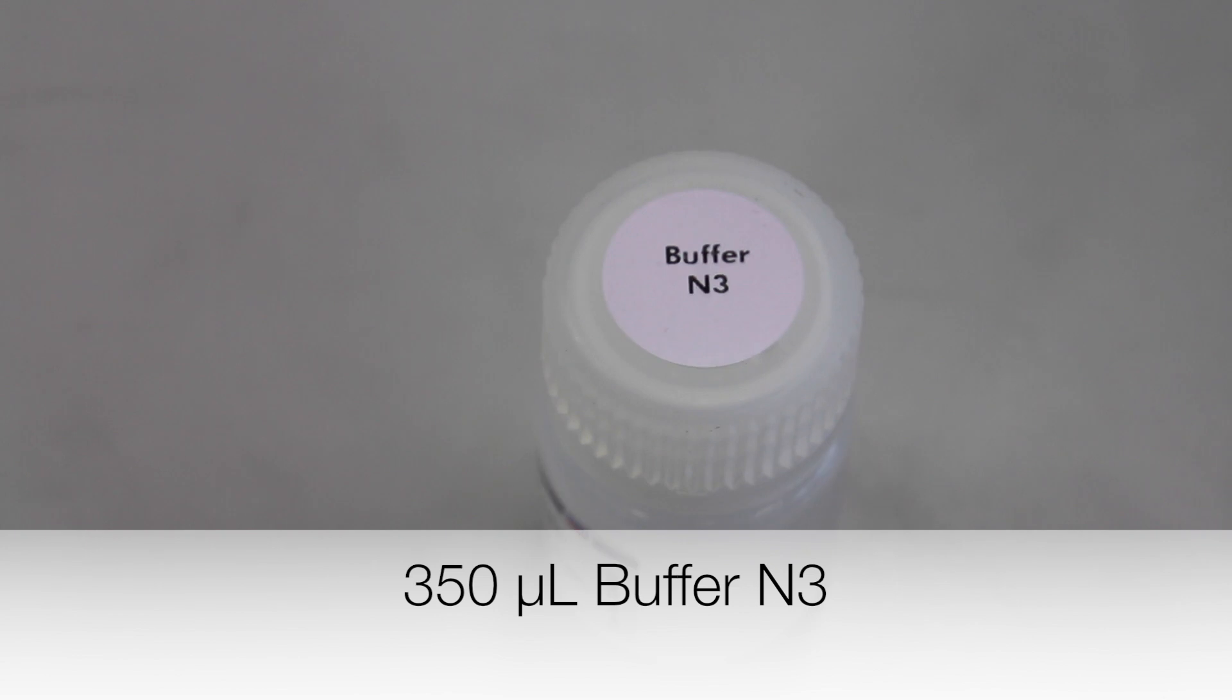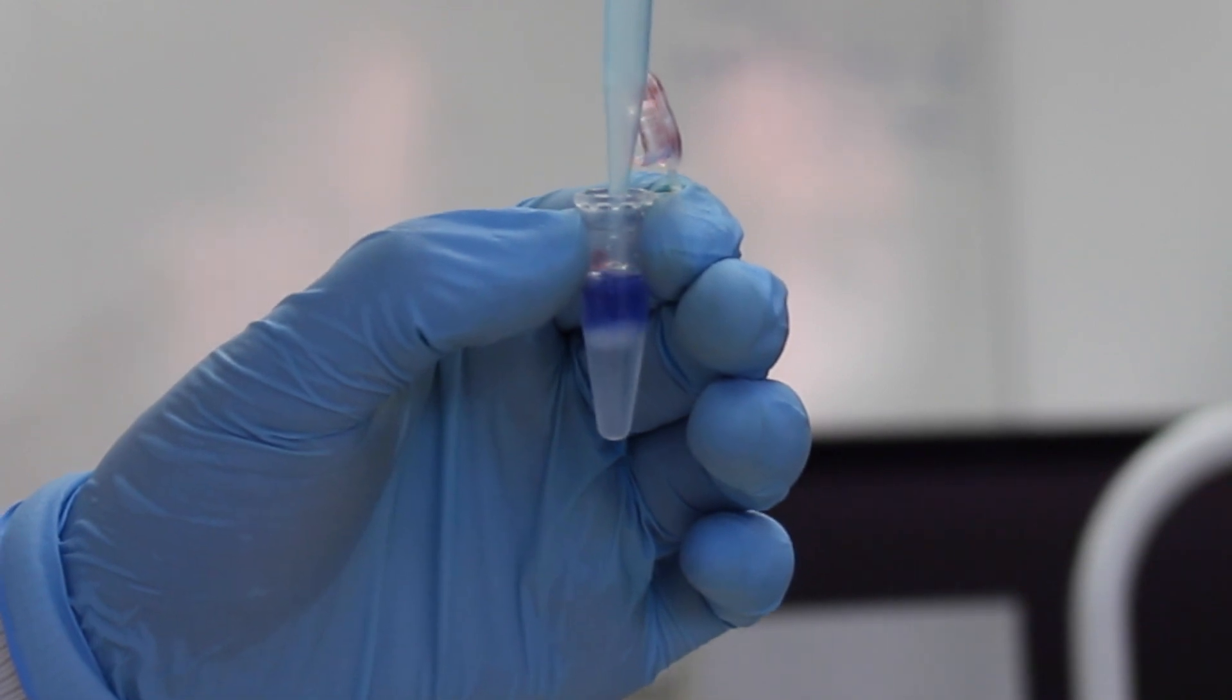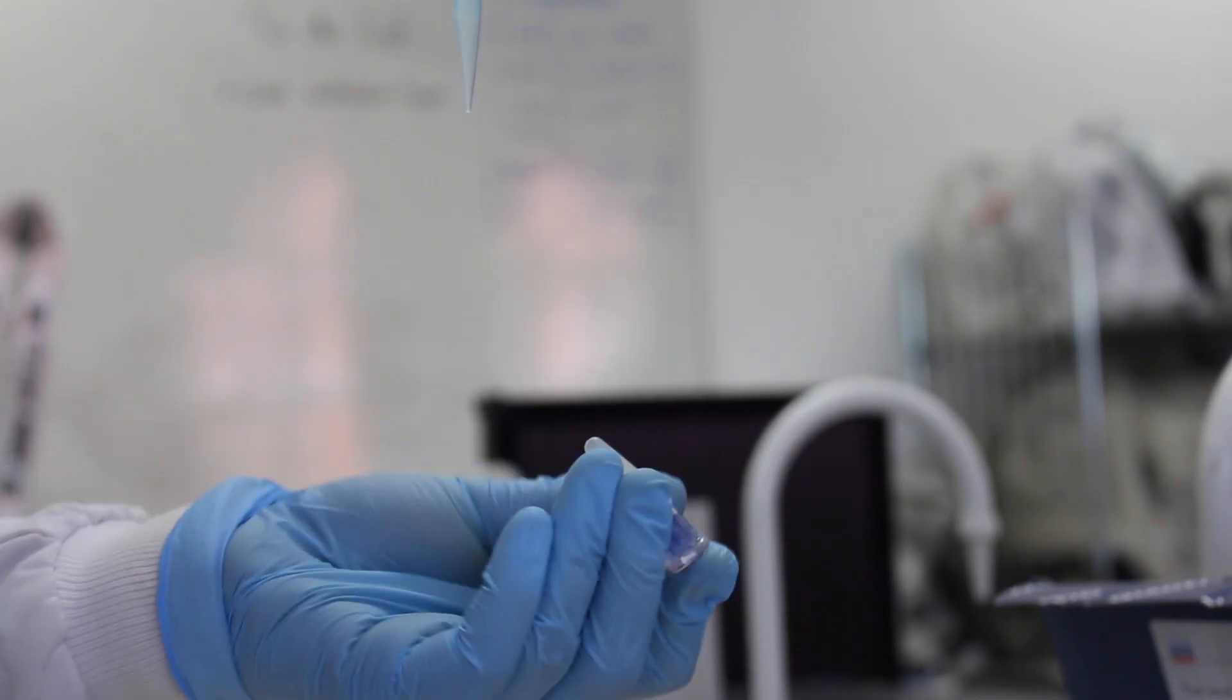The reaction is then neutralized with 350 microliters of buffer N3. This buffer contains guanidinium chloride which prevents protein folding. The tubes are inverted gently.